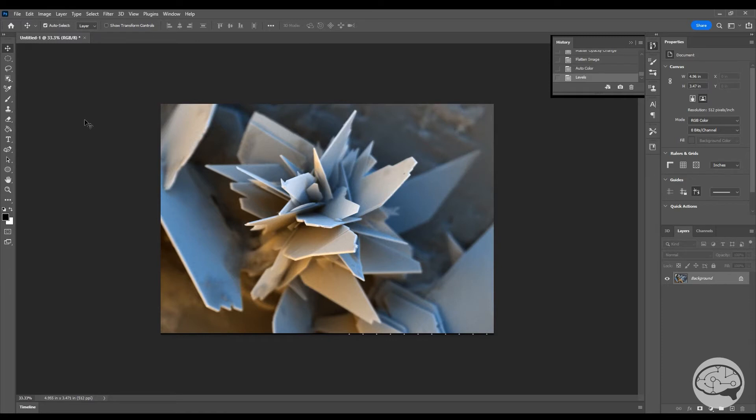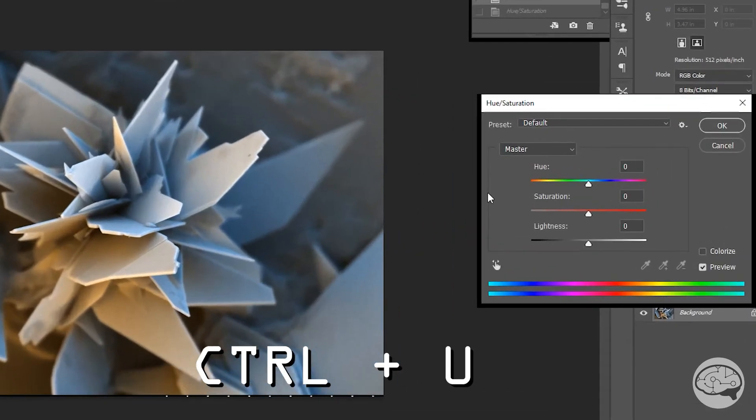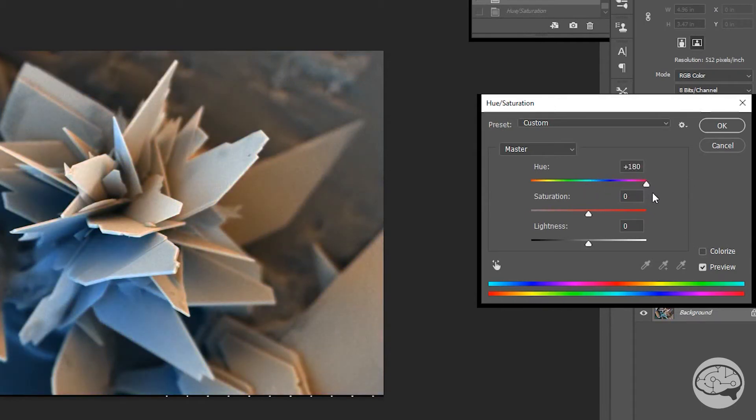First, let's say we're not 100% happy with these specific colors. We can back up several steps and switch which BSE images we were using or which RGB boxes we had checked in the layers. Or we can hit Ctrl U and open up the Hue Saturation window. Here, we can actually shift the colors around. So we can move this slider around until we have exactly what we want.